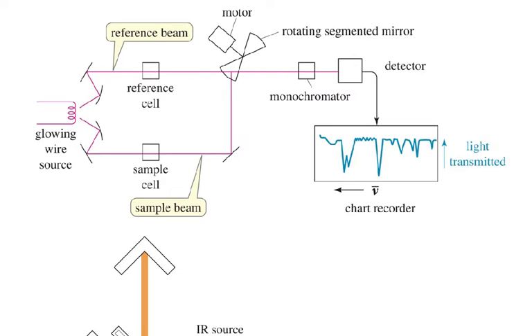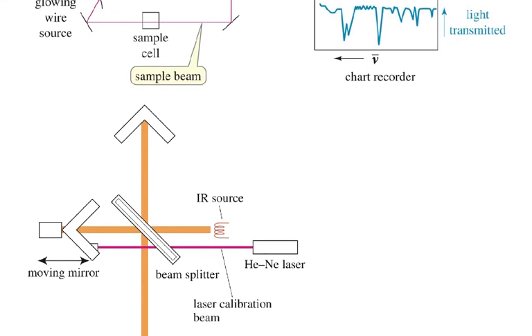Anyways, that tangent aside, the way this is going to work is that in whatever spectrometer you have, you're going to have a way to split light into lots of different frequencies, because we want to measure every frequency separately. So we're going to split up light using this mirror type of mechanism, and that goes through our sample. After the sample we have a detector, and the detector tells us what light we still have after it's gone through the sample. And then we get a spectrum.